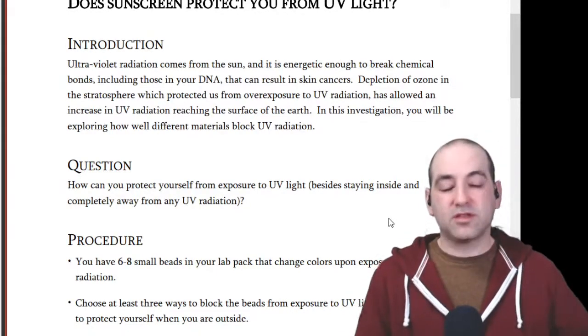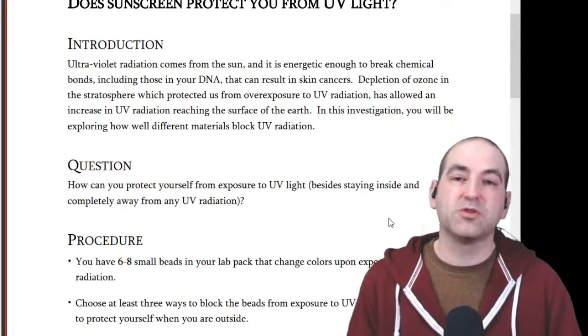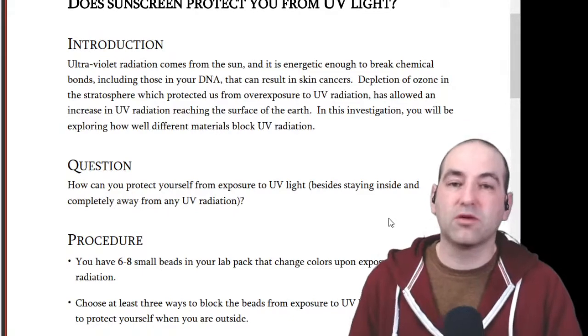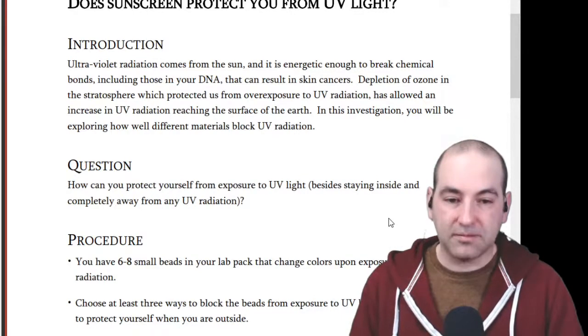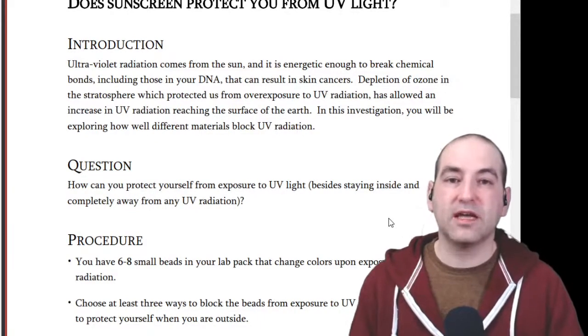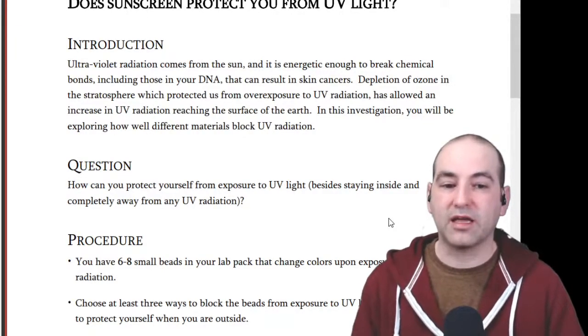But the thing that's so dangerous about UV radiation is that we're always being exposed to it whenever we're outside or even inside. Some UV radiation can go through windows as well. So we have to be careful and protect ourselves from that light. So your job in this experiment is to figure out how you can protect yourself from UV light by using the beads as a measure of how much UV light is getting through various blocking things.